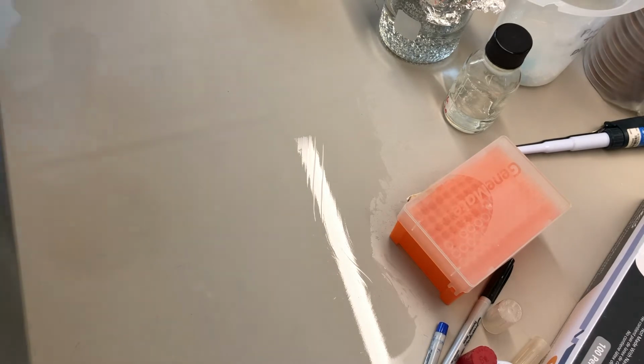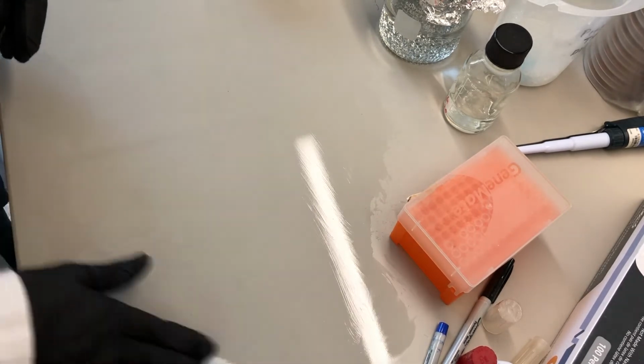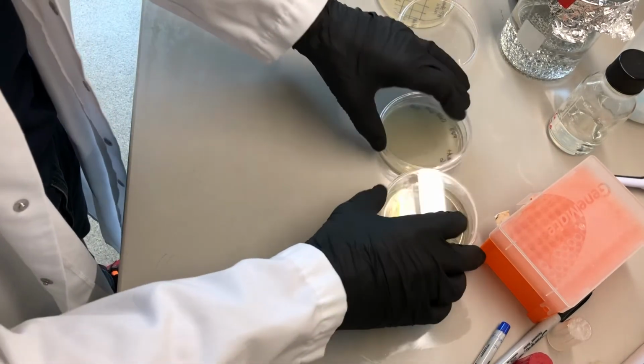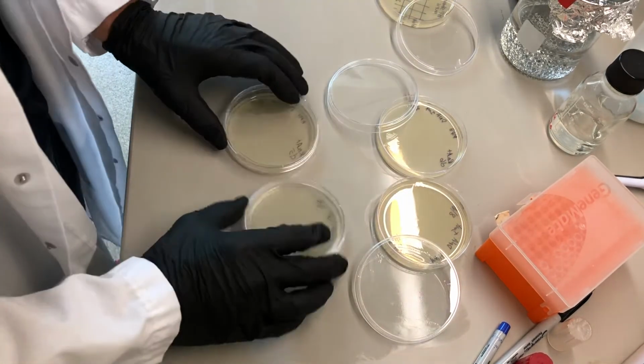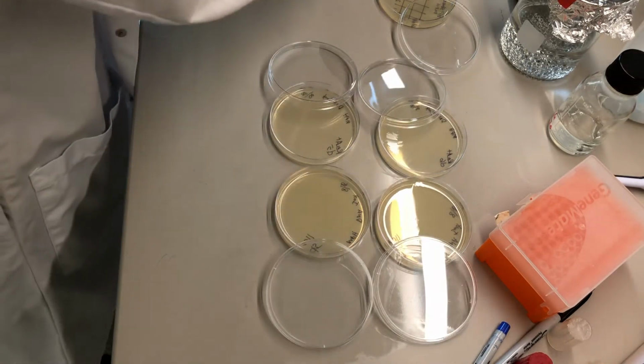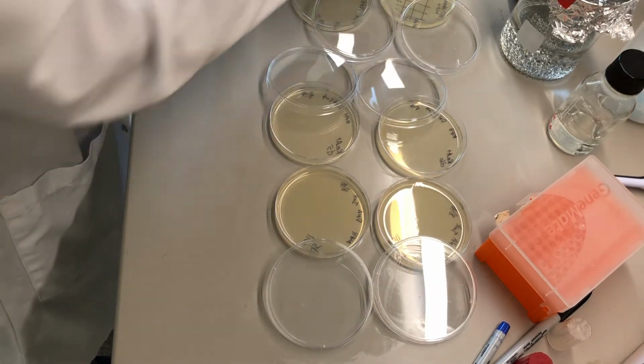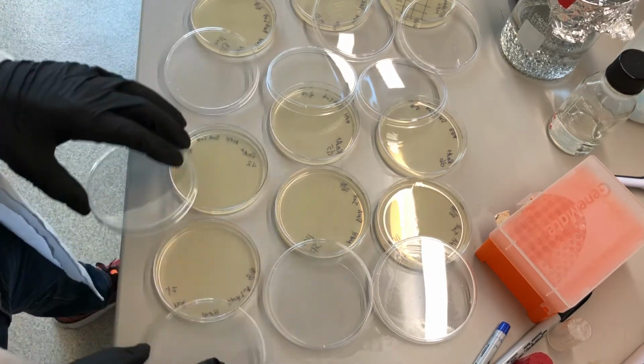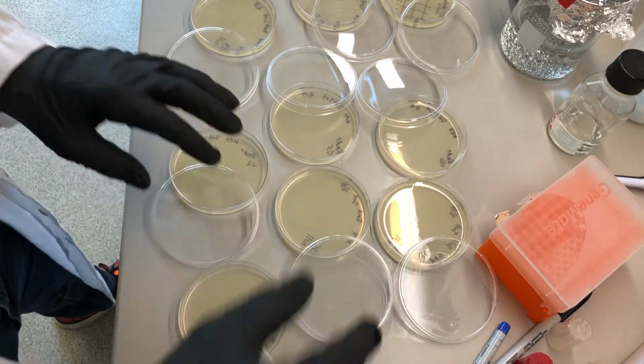And then I don't want all my label work to be washed away by the 70% ethanol, so I'll make sure that the bench is clean, but fairly dry before putting the plates down, removing the lids. Letting them get nice and dry before it's time to seed the plates.